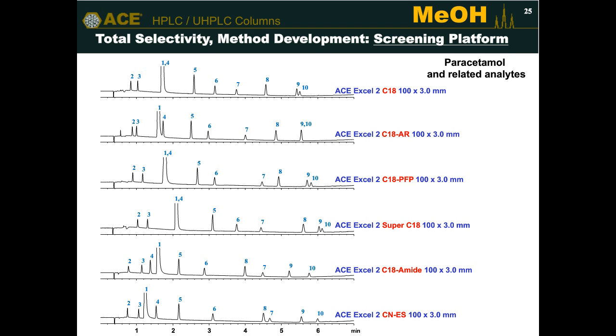Of course, the difficult situation is where you are given, which is a situation I'm very familiar with, as I worked in the pharmaceutical industry for a long time, degraded samples, or a sample where maybe there's one or two compounds that they know are in there, but there's a whole host of other stuff in there. In this example, selectivity is actually your friend, because you can use different column chemistries to try and, very crudely, count the number of peaks that you have in your samples under different conditions. So if you use a different type of organic solvent, different column chemistries, with different mechanisms of interaction, and even different pH, so a low pH or mid pH or even a high pH, then you can start to build up a picture of the composition of that sample, even if it has many unknowns in it, because you can literally count the number of peaks.